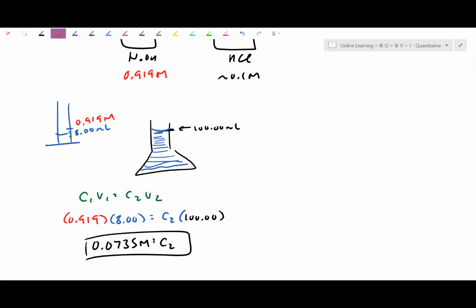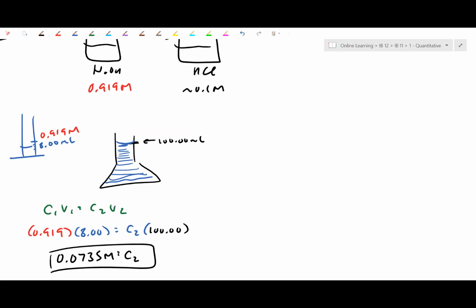Again, what we did is a titration. We tried to pull 25 milliliter aliquots. Remember, I forgot to add indicator. Oh no, I wasted that 25 milliliters. For the very last try, I actually only took a 10 milliliter aliquot of it. So I just made a note of that. That was the HCl.